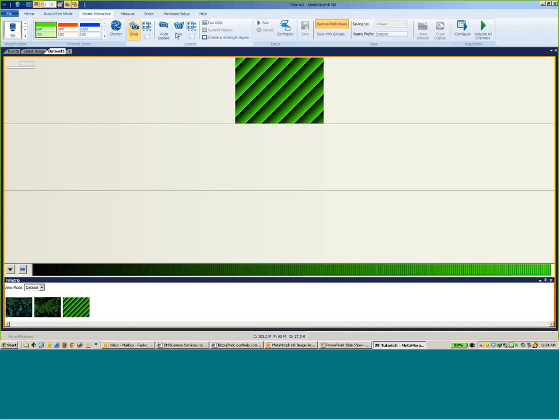So you set the illumination, which was our GFP, you set our magnification, and then we can adjust our exposure time. Then the set illumination for the pulse, so you have to have the illumination setting configured to turn on your lasers and do the exposure for the laser aspect of it. So that's the setting you use here. Then you're running through the calibration area.